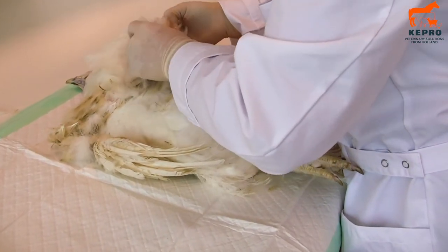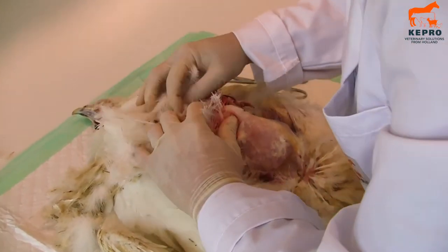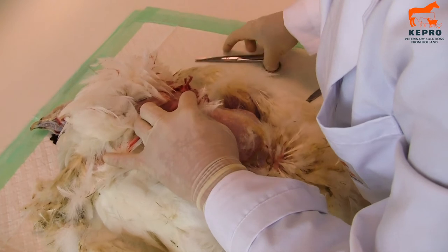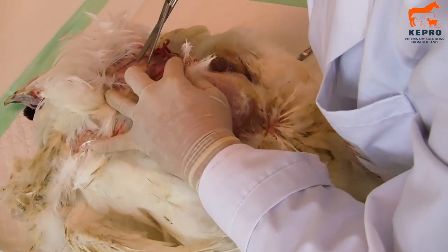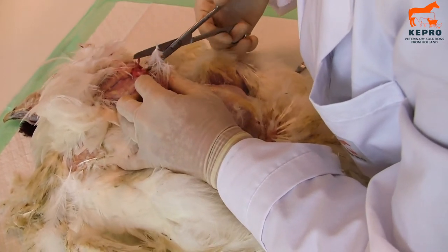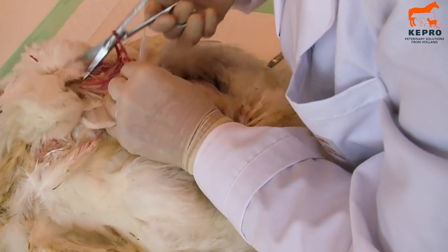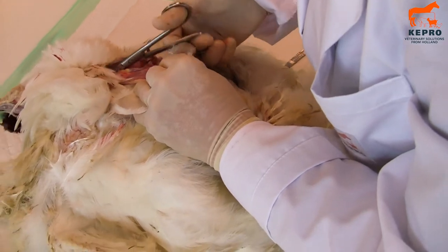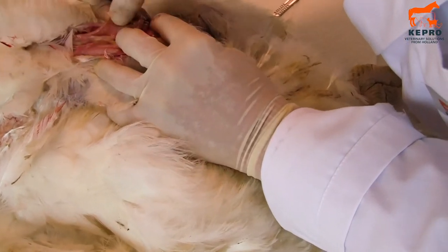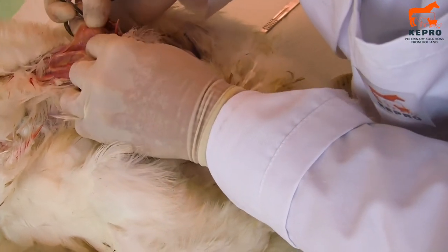Now you start looking at the esophagus and the trachea. The trachea looks nice and clear. When you cut it open there should not be any mucus in it. And you see here there is a little bit of mucus in it, but for the rest it looks all clear.